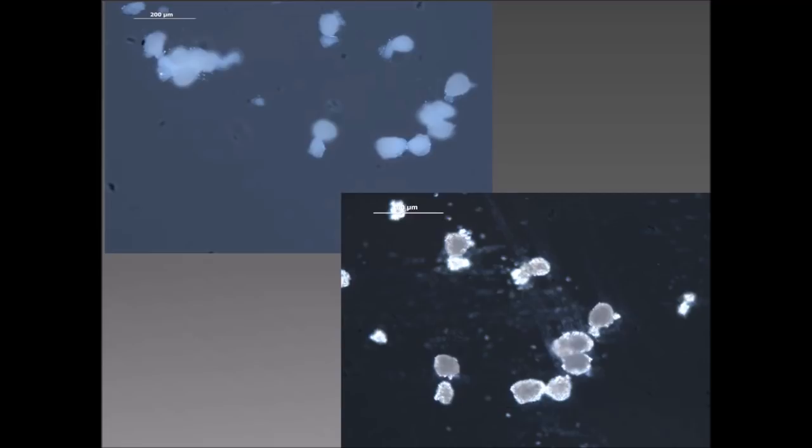If you look in more detail, you can see there is some shining starting to grow at the edges of this solid, because when an amorphous solid absorbs a massive amount of water or moisture, it will increase in molecular mobility and decrease the Tg, and so it will easily turn to crystal. When it turns to crystal, if you observe under the microscope, you will see what you call birefringence properties.